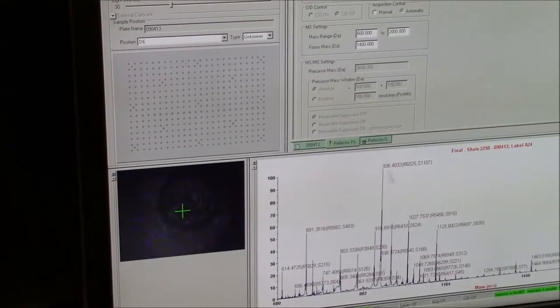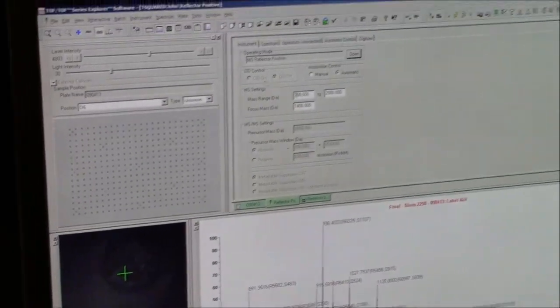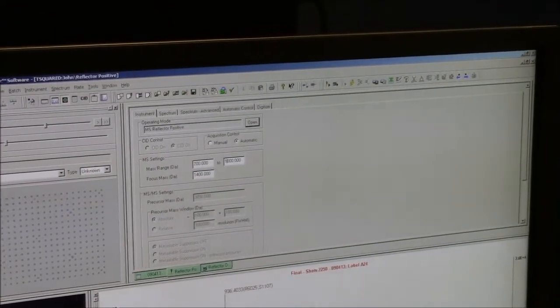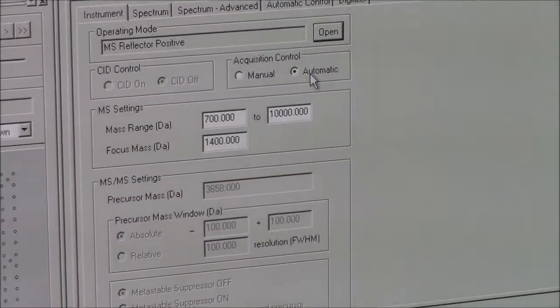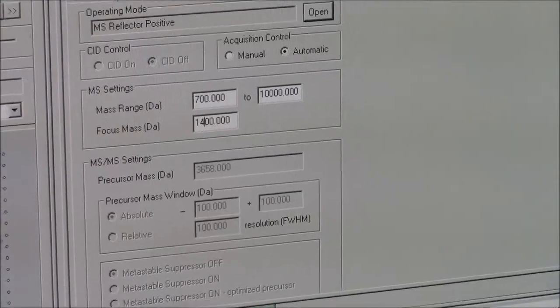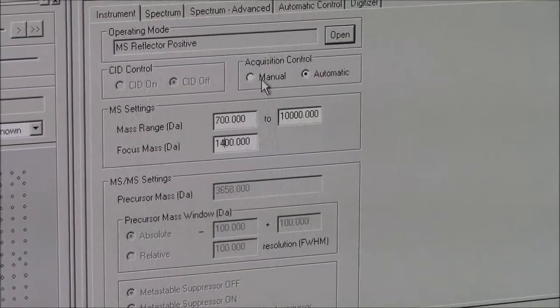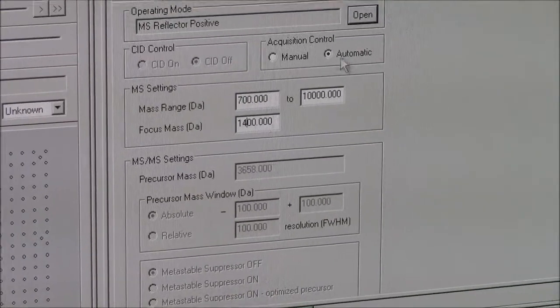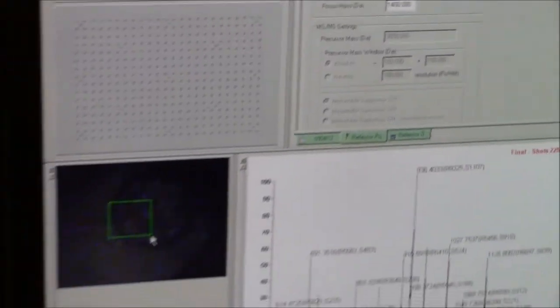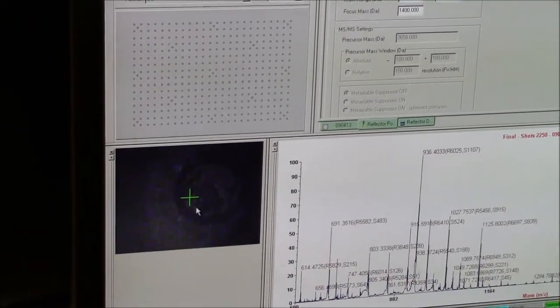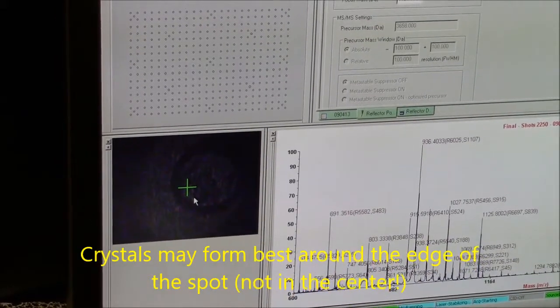So let's work your way up. So we're at our spot. This machine's interesting, so you can select your range. So we're going to do 700, like I was saying for DHB, up to 10,000. It's a good range. Automatic acquisition mode. I like automatic acquisition. If you were really crazy and you wanted to run it manually, you could, and then run it off the PlayStation controller here. I don't really want to do that. Automatic mode, you just box a region which looks like it contains crystals.